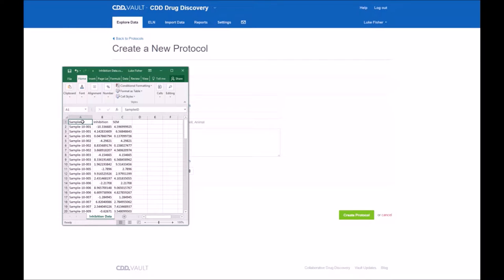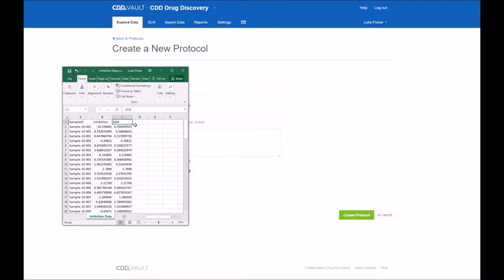Before you create the new protocol, I always like to look at the input file to make sure I have information ready. So in this case, very simple. We just have inhibition and SEM, and we have replicate data across the different samples. That's important that we'll talk about soon.